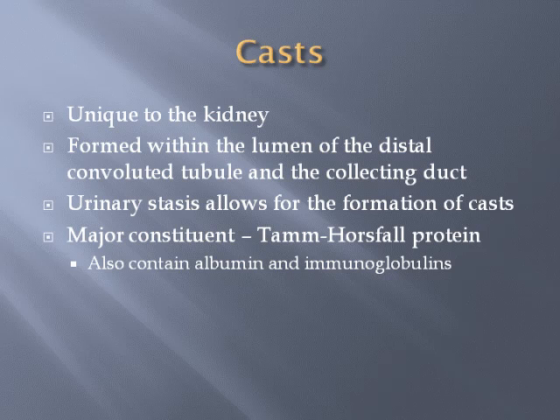Some of them can be normal and some of them very abnormal, so you need to be able to look for these. Remember, they are reported per low power field, so you want to take a look on low power, turn down that light. They like to hide out around the periphery of the cover slip, and turn down that light so you can see them. You need to use your microscope skills and finesse and focus back and forth to try to find a lot of the casts.